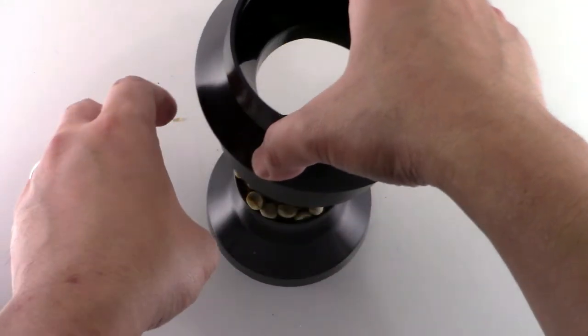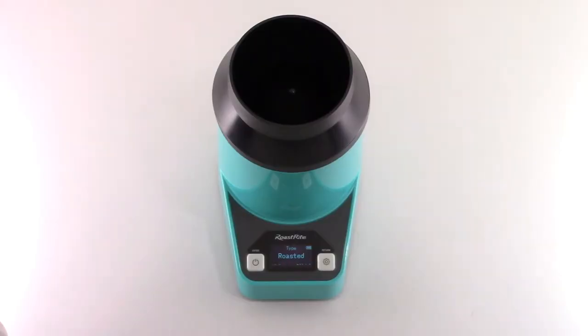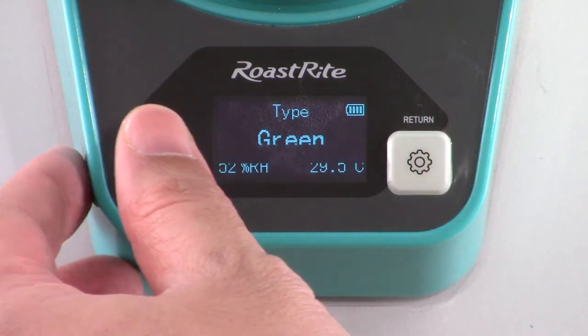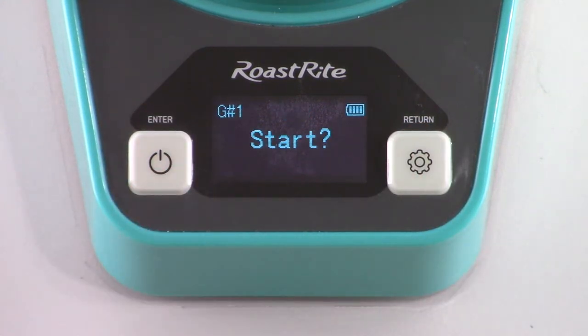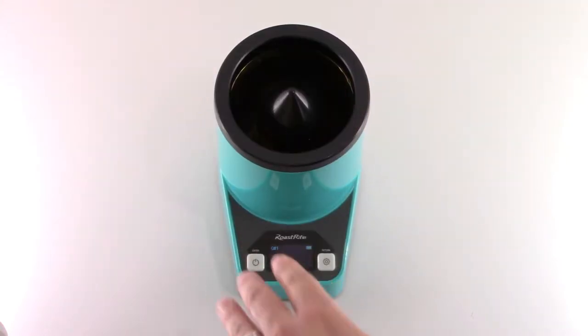Pull the hopper up and scrape off excessive beans. Press the right button to select the type of coffee sample you want to measure, then press the left button.